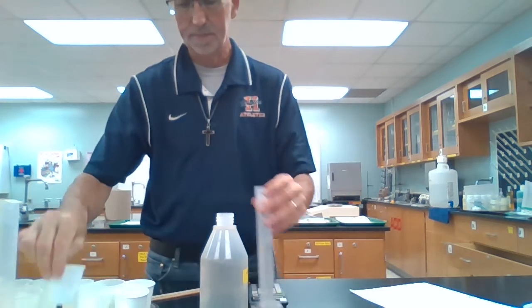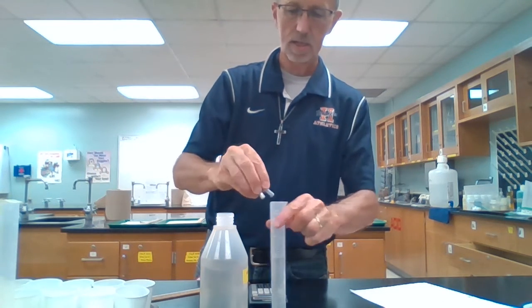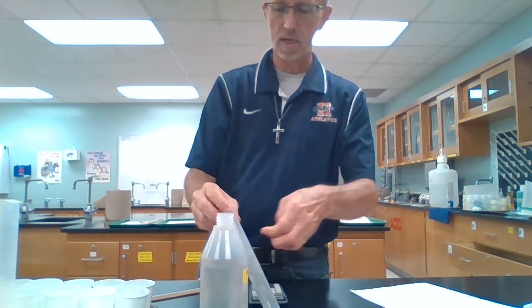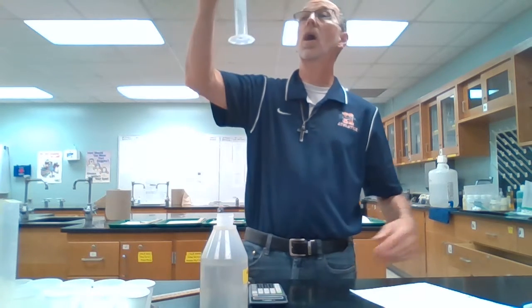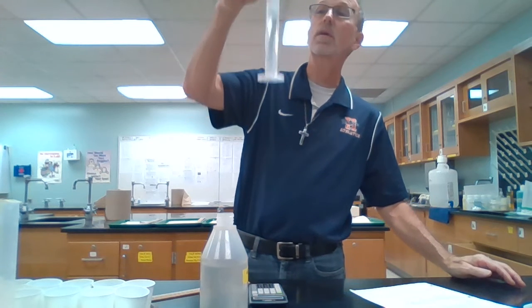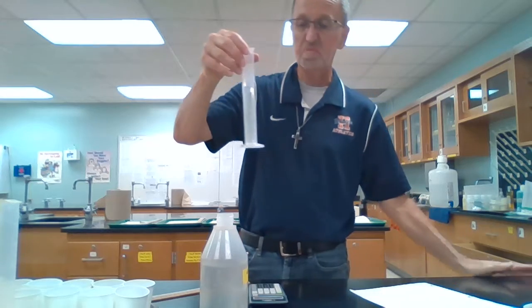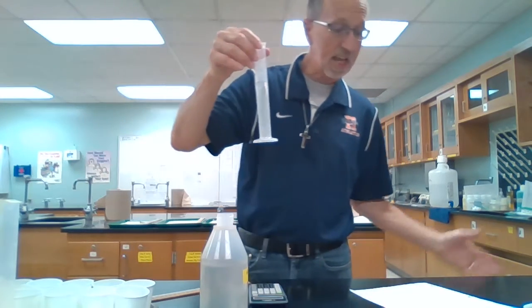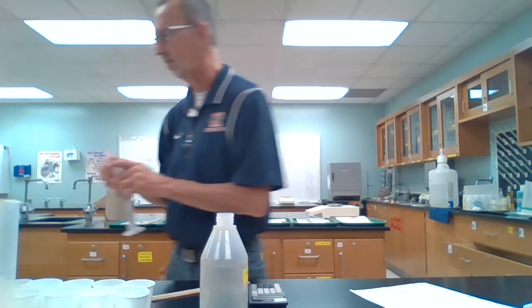Number 3, back to these bigger pieces again. Drop those in there. There we go. And after subtracting, looks like we're right around 5.0 mLs again.